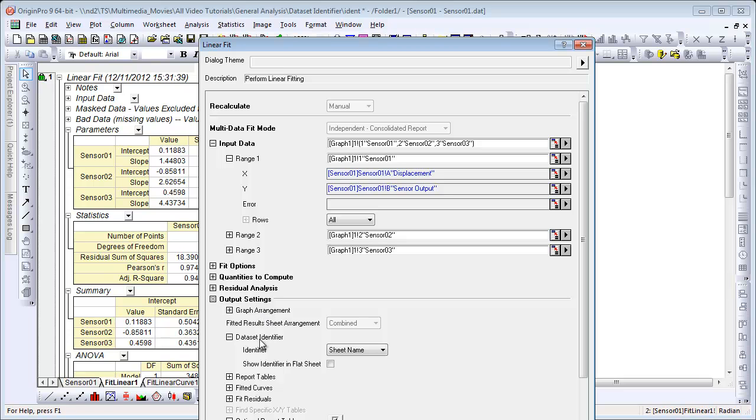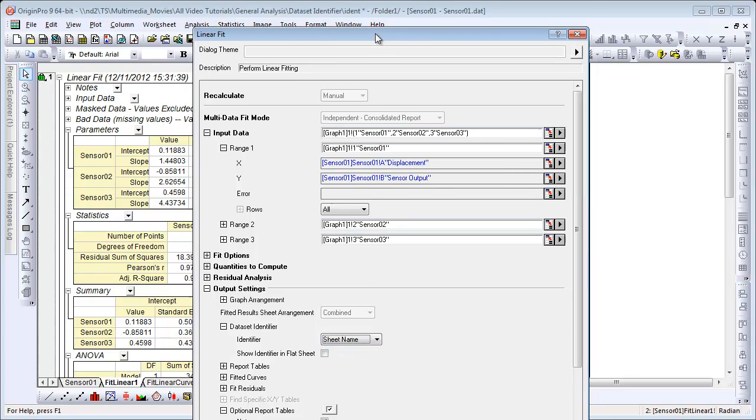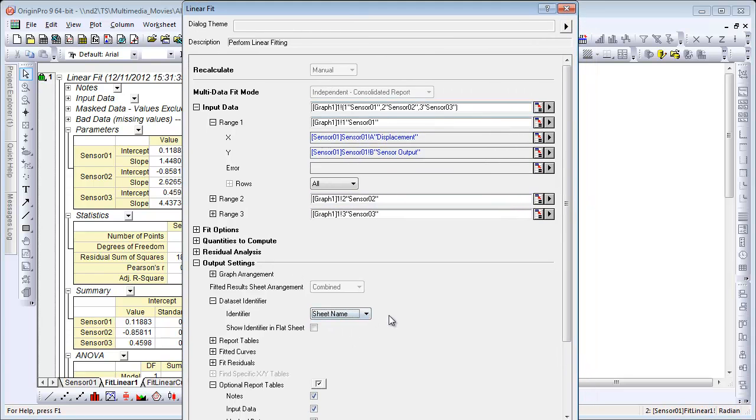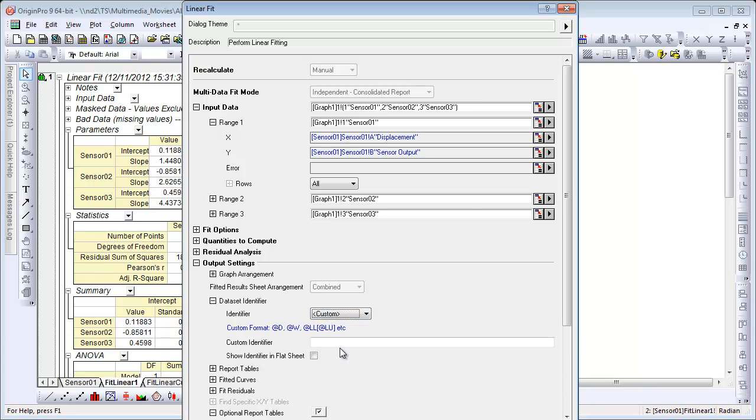Now it's picking up sheet name because that's what we had specified. You can choose from short name, long name, units. You can also choose Custom, which allows you to enter in a combination of multiple options, such as the long name worksheet name. So you have complete control there.